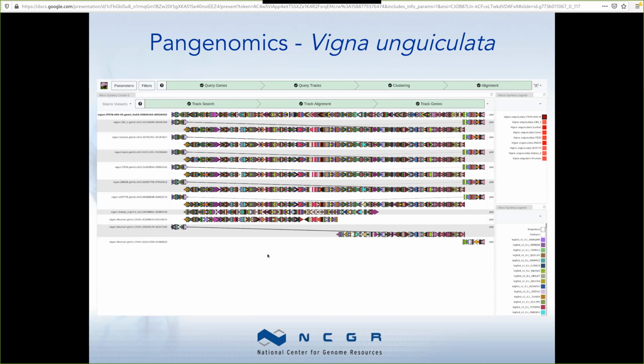And so at the bottom here, we've actually pulled in Adzuki bean as well, which is an outgroup of cowpea. And we're basically using it to infer the likely ancestral state of this region. And basically, we're doing that to help avoid orientation bias, which is a nice feature if you're worried about oversampling or something like that.